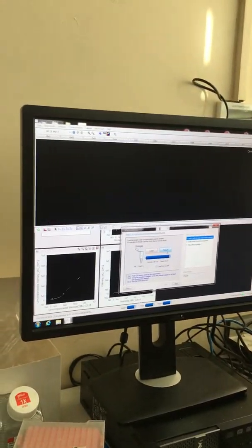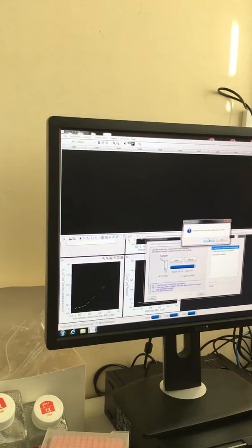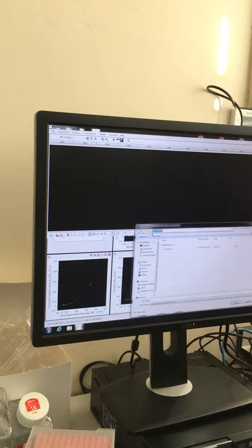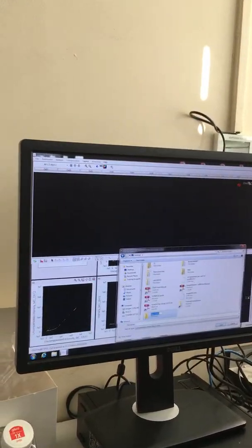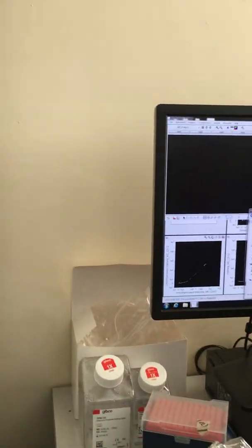Okay, so press exit. No, press exit. Yep. And then you want to go onto the desktop and make a new folder. Right click and then new folder. Call it ASA, whatever the date is. What's the date? Today, 26.